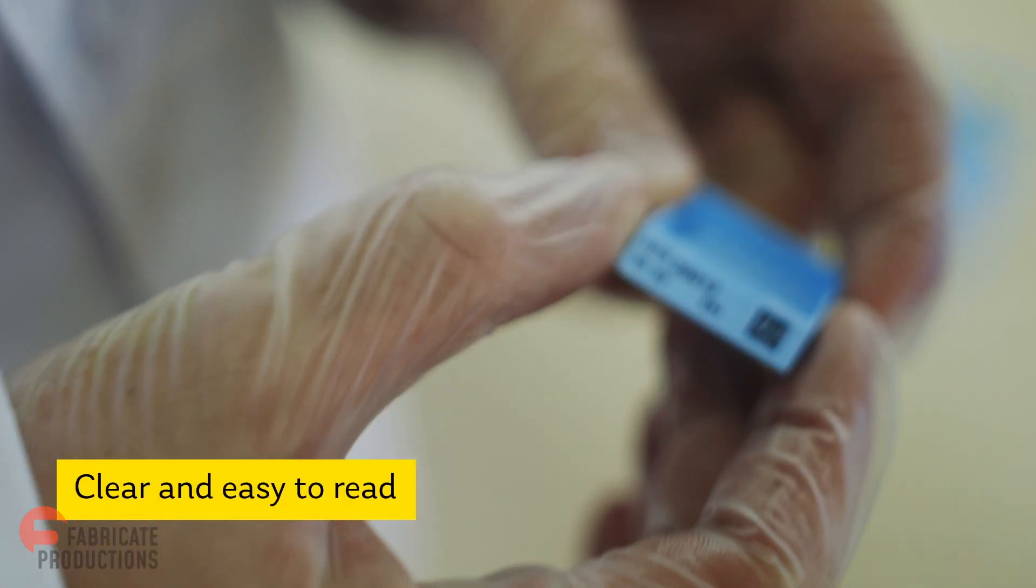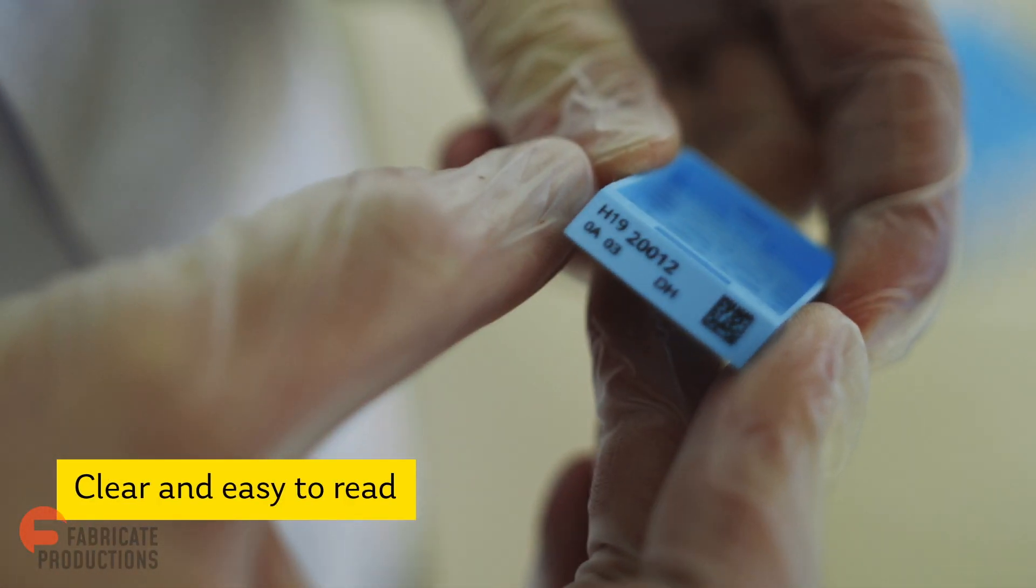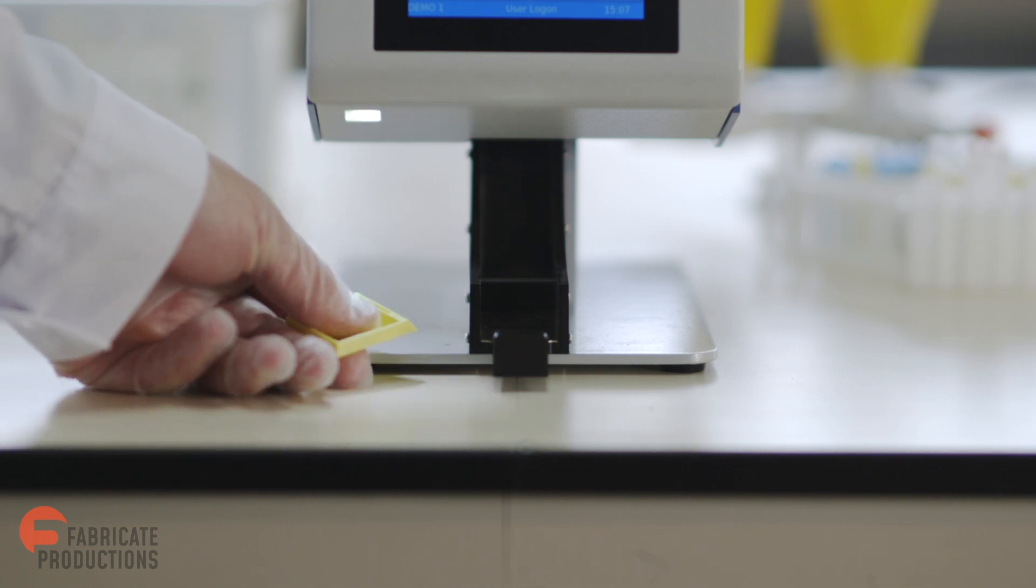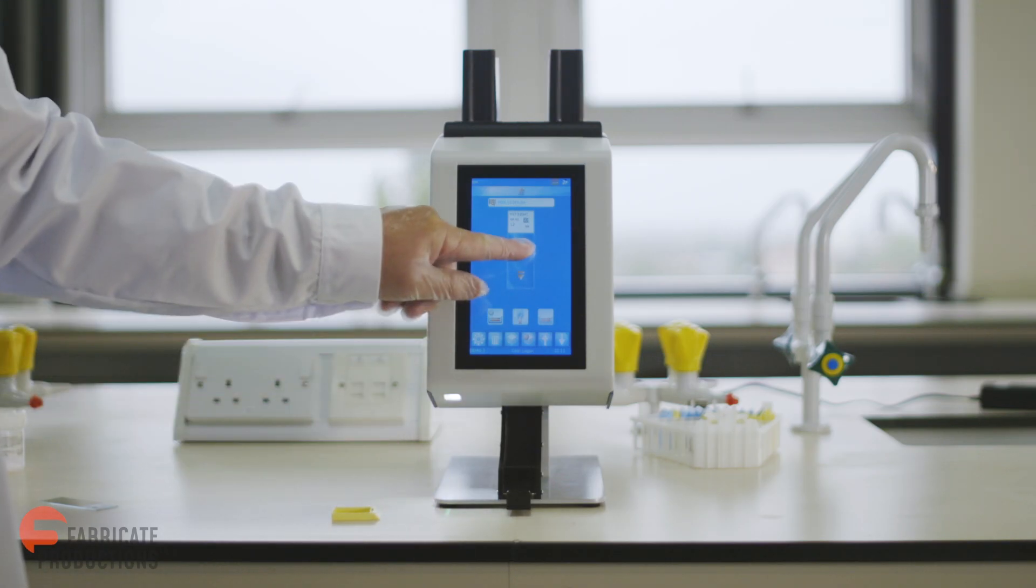A printer that prints clear, easy-to-read text and barcodes directly onto the cassette. The data can be scanned into the smart slide printer.